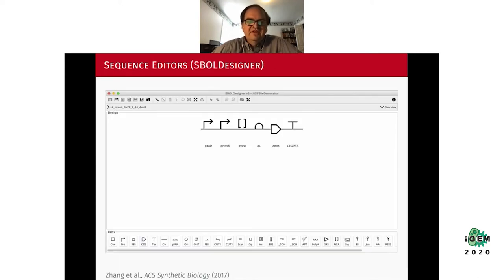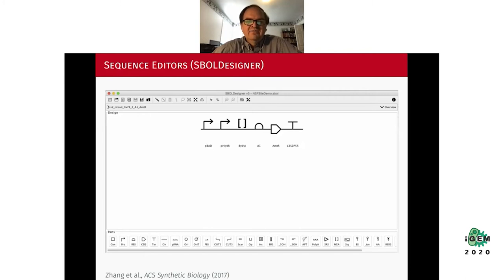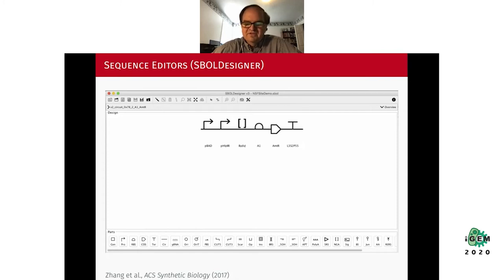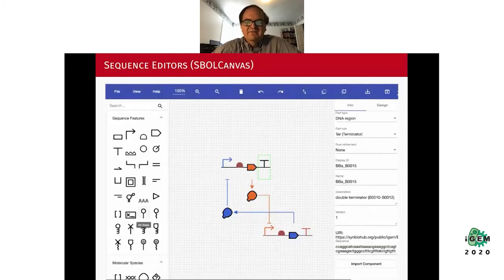Those sequence editors were all at the very low level, basically examining and manipulating DNA base sequences. In the SBOL community we've developed a couple of other sequence editors that allow you to edit things at a higher level of abstraction — describing your designs as collections of parts and components, such as a design showing promoters, ribosome binding sites, a coding sequence, and a terminator constructed together to build a transcriptional unit. This is using a tool called SBOL Designer, developed in my research group at the University of Utah.